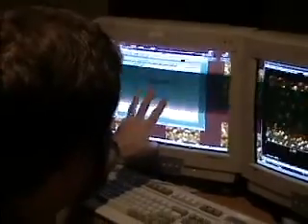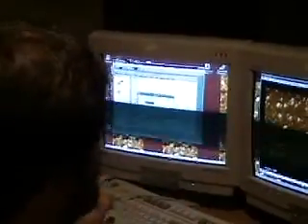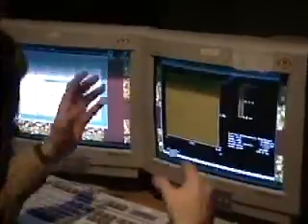If I go to View, Top View, this brings up a generic box where I can adjust, let's say, the data scale, which is cosmetic only. Right now it's set for 80 nanometers. I can set it to, let's say, 120 nanometers if I want to have a bigger range of data scale. And I can also adjust the color contrast, which just changes how the range from black to white is mapped. So higher color contrast means that the change occurs in a smaller interval near the average Z value, and lower color contrast reduces the contrast, so most of the time you want to keep this close to 0.